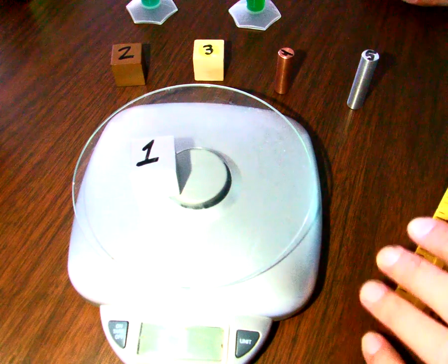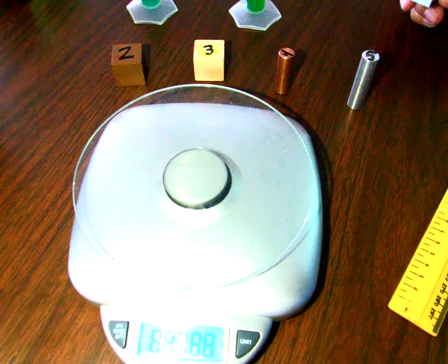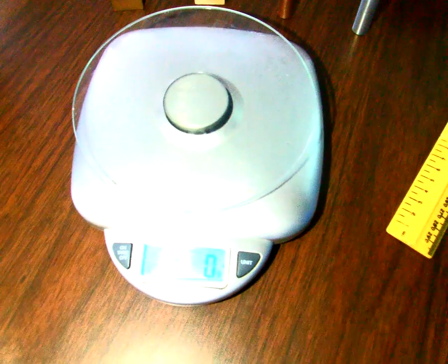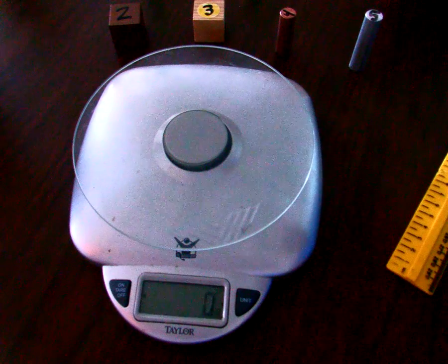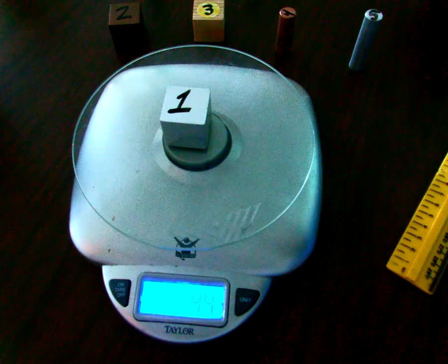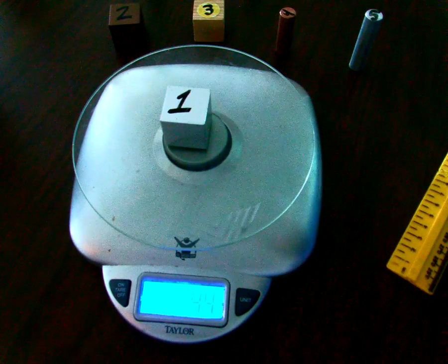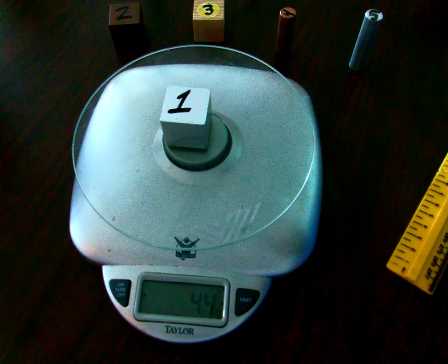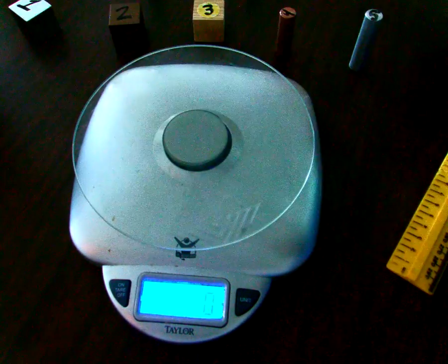All right, so you should have your volume calculated. We're going to go ahead and mass this. We're going to turn on our scale. I'm going to put this down a little bit so you can see. I'm going to turn this light off, you can see even better. All right, so we're going to weigh our block 1. Block 1 weighs 44 grams. So please go ahead and write that information down as the mass for block 1. 44 grams. We'll go ahead and take that off.